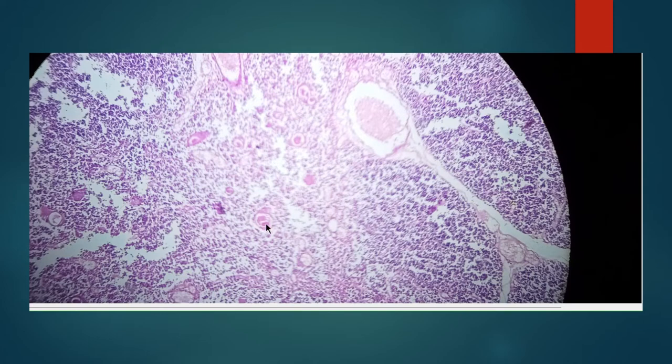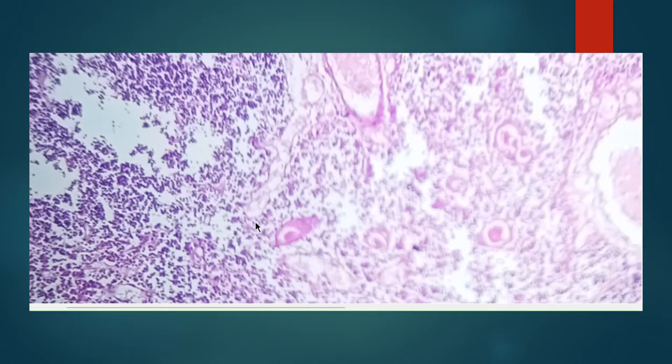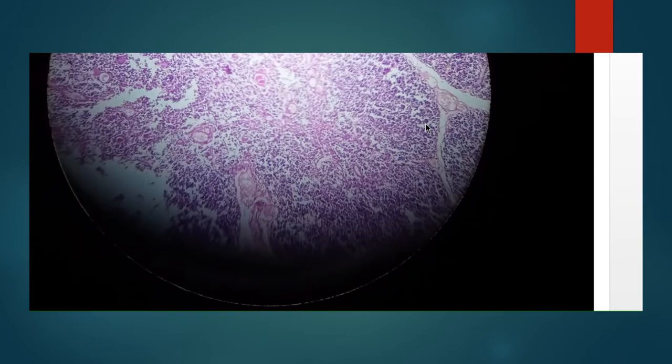Okay. And you can see the rosette shape also. Let me focus. Yeah, here you can identify dark eosin stained structures and a rosette shape. That is nothing but your thymus slide. Thymus. Okay. You want me to focus another slide?